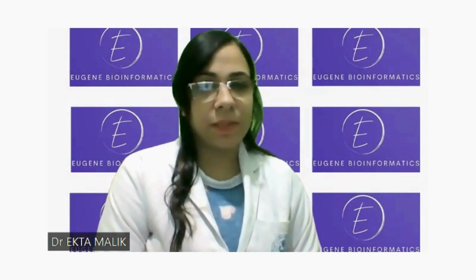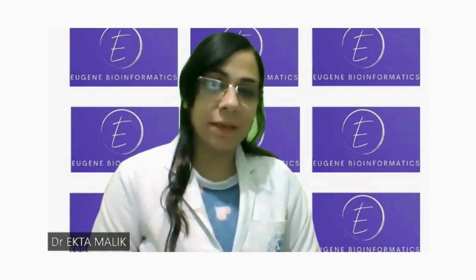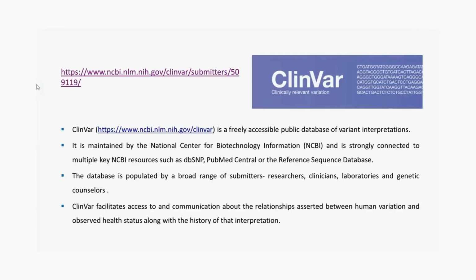So today I will discuss a very interesting topic, that is variant classification according to ACMG-AMP guidelines. Before starting, I would like to tell you about the ClinVar database. I think many of us know about it.